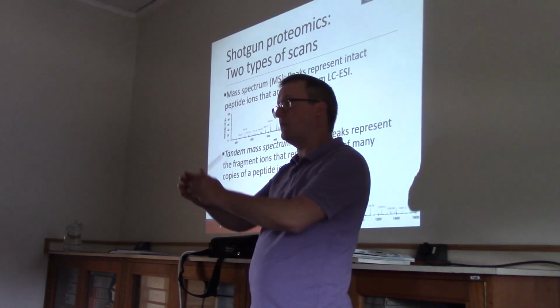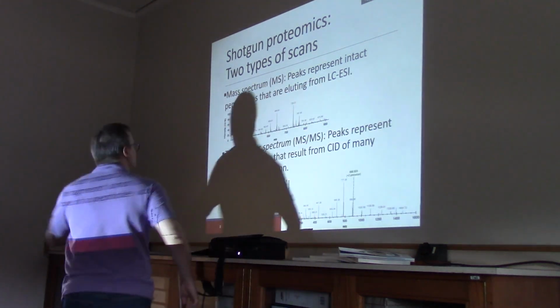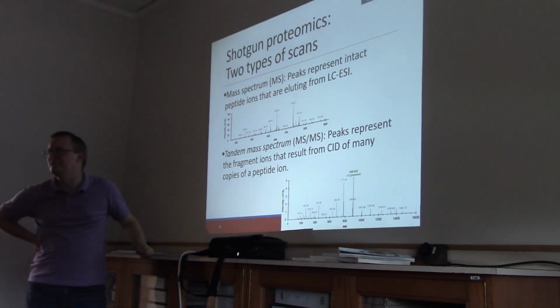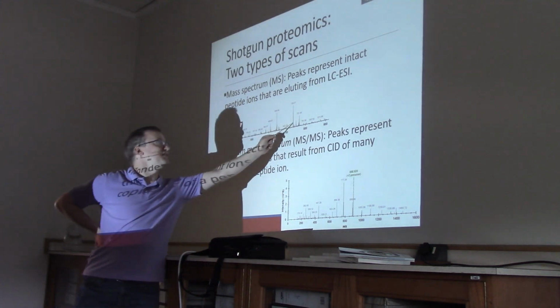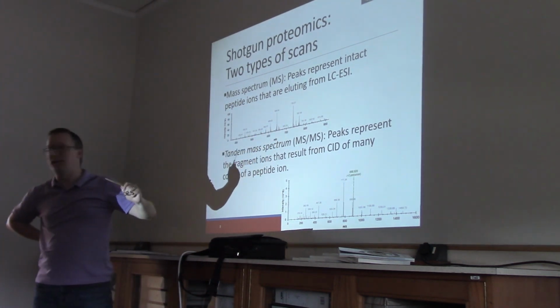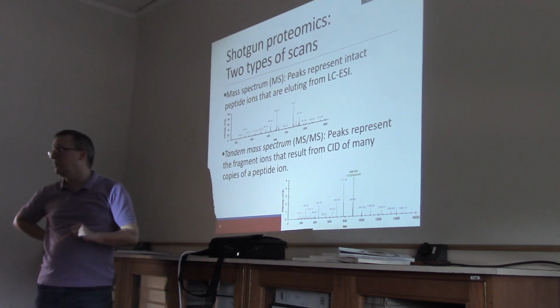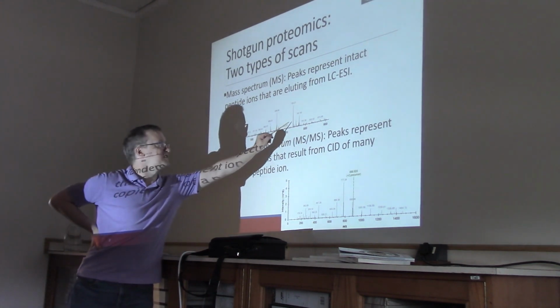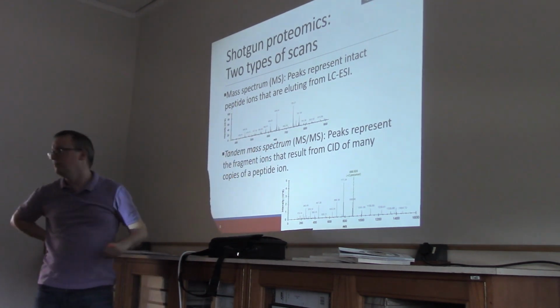So the ions are being illustrated across that mass-to-charge axis. And then we have an intensity signal. Now this is not abundance. It's not abundance. So if we see that the ion at 735 produces a big peak, and the ion at 582 produces a small peak, there's some temptation that you would say, there must be more of this ion at 735 present than at 582.